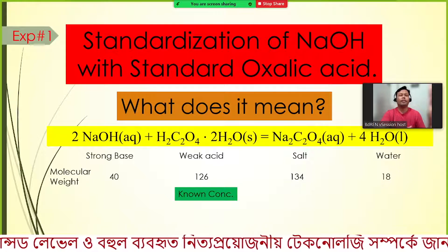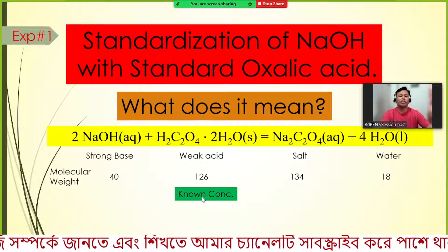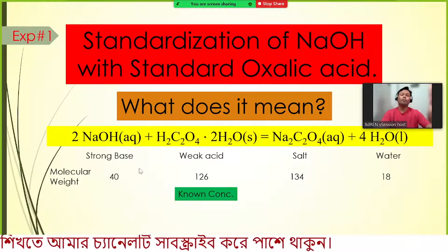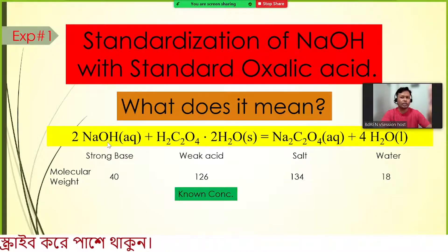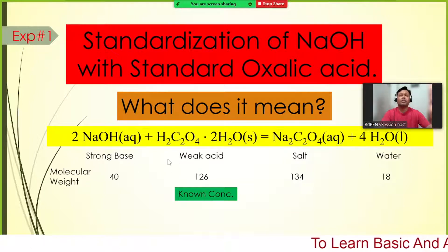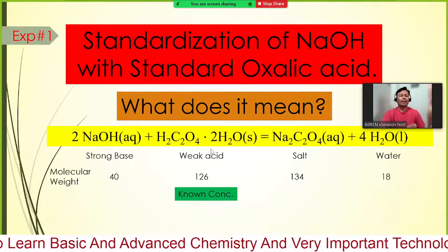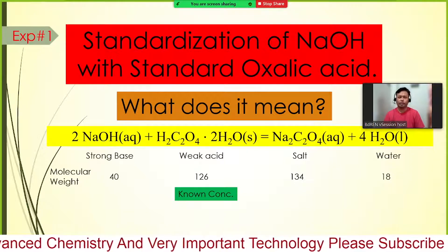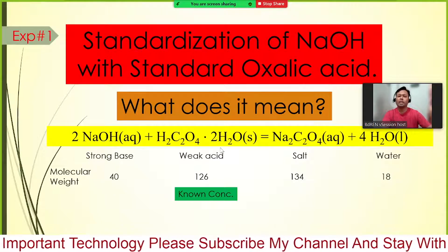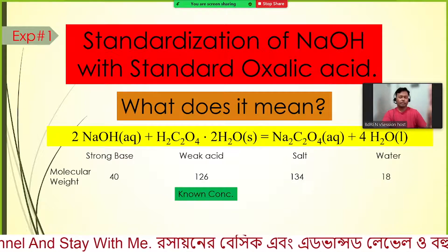In an exam, you will be provided a solution of oxalic acid with known concentration and a solution of sodium hydroxide with unknown concentration that you must determine. Today we will learn from scratch: how to prepare a sodium hydroxide solution, how to prepare an oxalic acid solution, and then how to determine the concentration of sodium hydroxide assuming it is unknown while the concentration of oxalic acid is known.